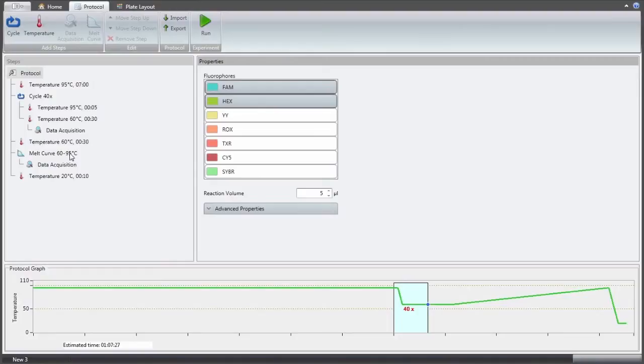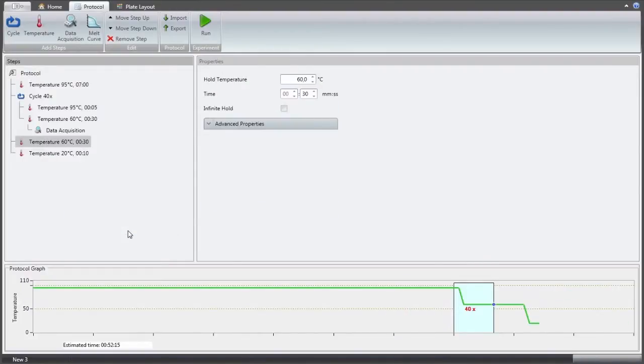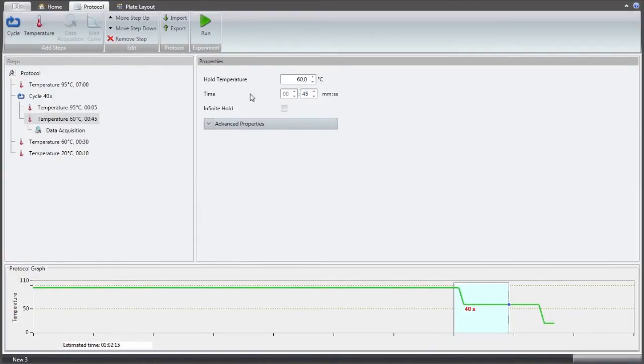Before starting a run, the instrument needs not more than information of the temperature steps and fluorophores to be measured. This information can be given to the instrument also by using a USB stick.